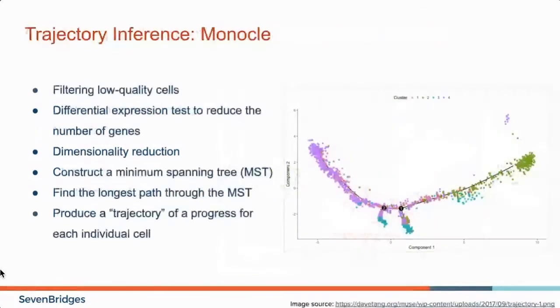Next slide, please. Okay. So the third package we'd like to highlight is Monocle. And cells that exist in different stages of development within the same population can display different transcription profiles over some time period. The package Monocle provides methods for ordering single cells and placing them along a trajectory that corresponds to a biological process such as cell differentiation.